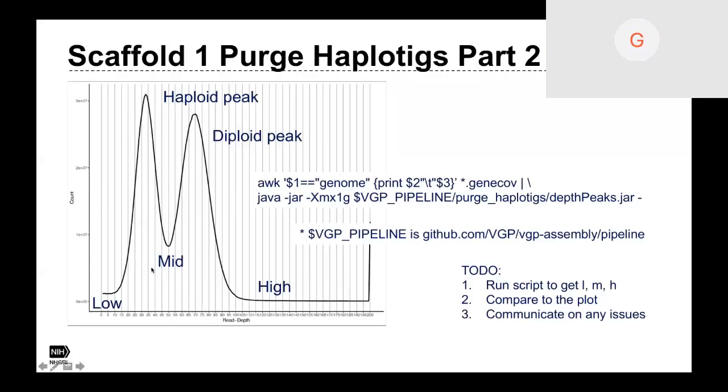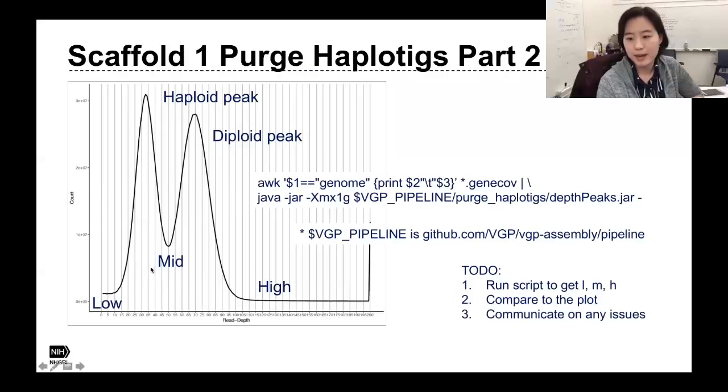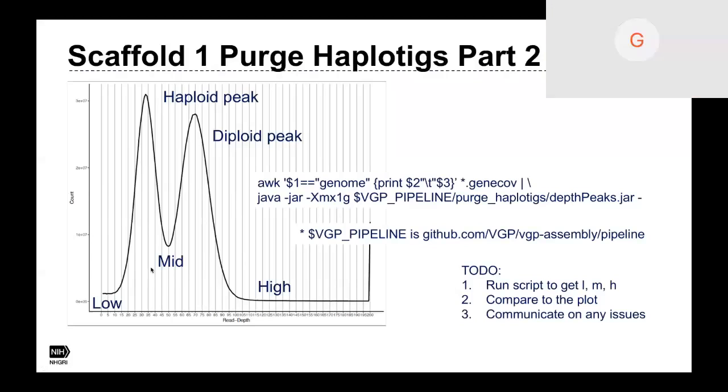So it remains the one, whatever was longer and was including the other haplotype. So the shorter one will get dumped into the purged haplotype. I see. Okay.